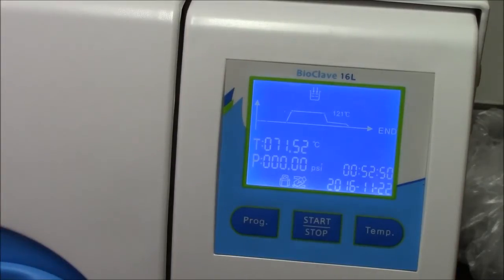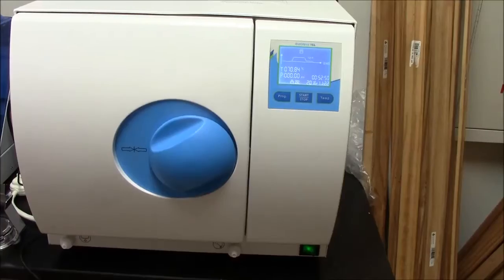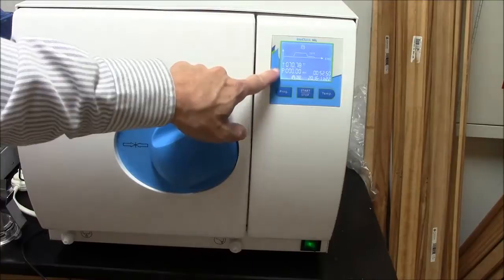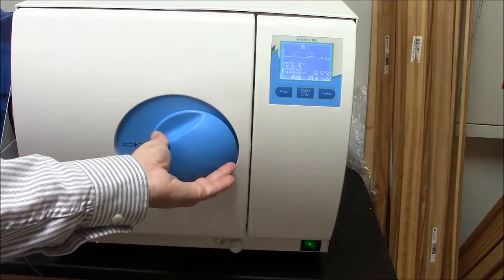It's been about 20 minutes after it finished. I'll just let it cool off. Temperature is at 71 degrees Celsius but the pressure is at zero and the run is done.